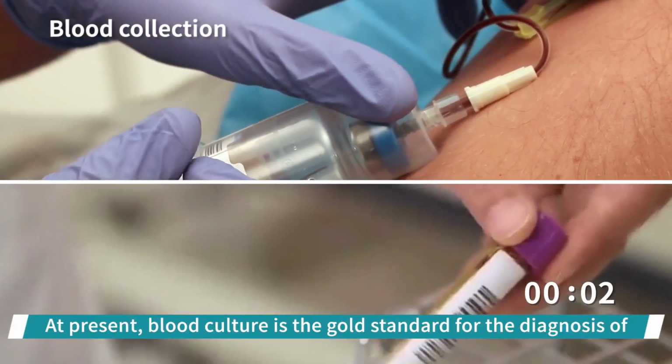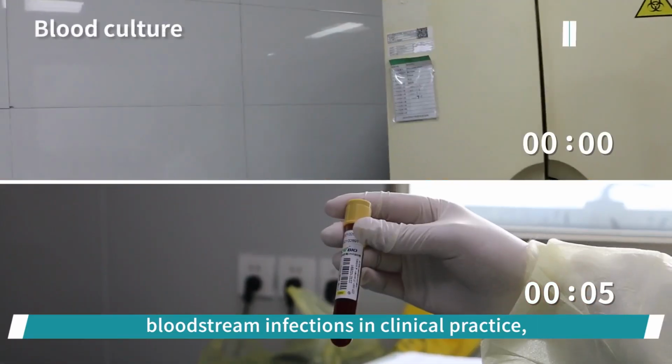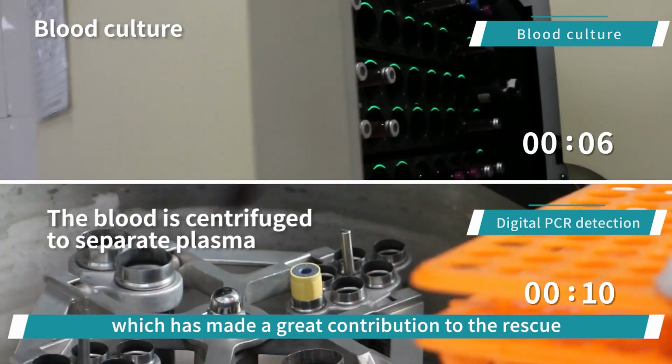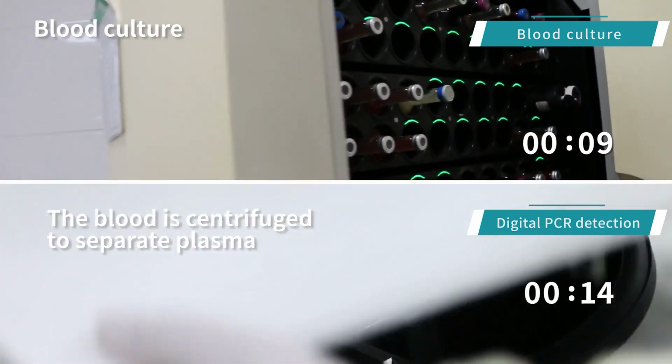At present, blood culture is the gold standard for the diagnosis of bloodstream infections in clinical practice, which has made a great contribution to the rescue of patients with bloodstream infections.